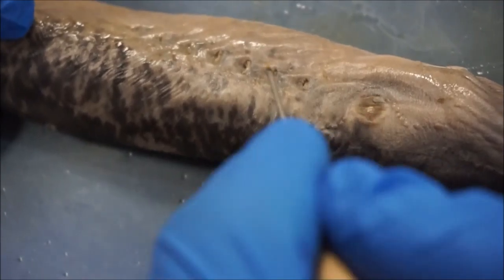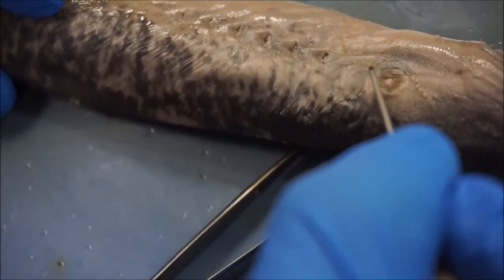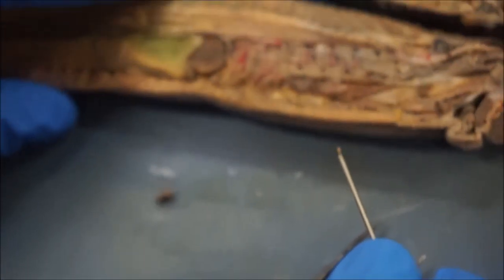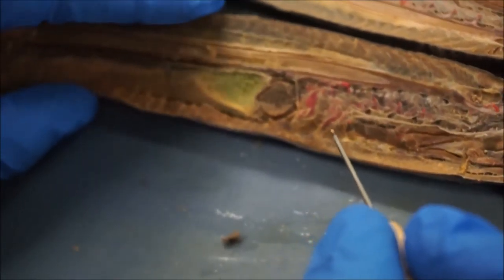Other than the eye and the gills, those are the only other sensory organs. Other than that, the lamprey itself does not have much in the way of sensory organs.